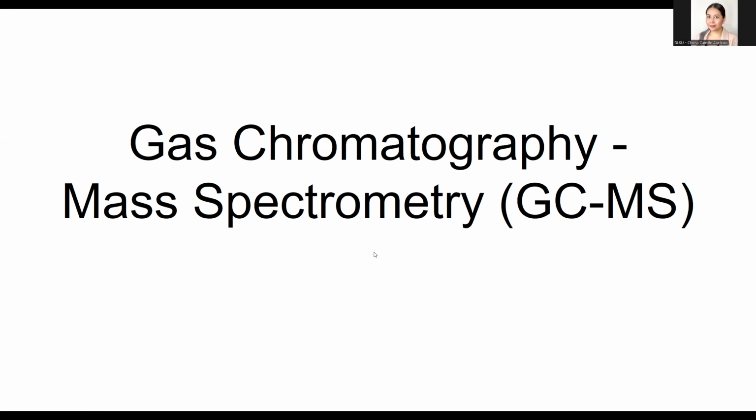So we are finally on our last module for genomics and proteomics lab. And this is the last module before your expert talk on our final meeting this term. And it's on gas chromatography and mass spectrometry, or GCMS.